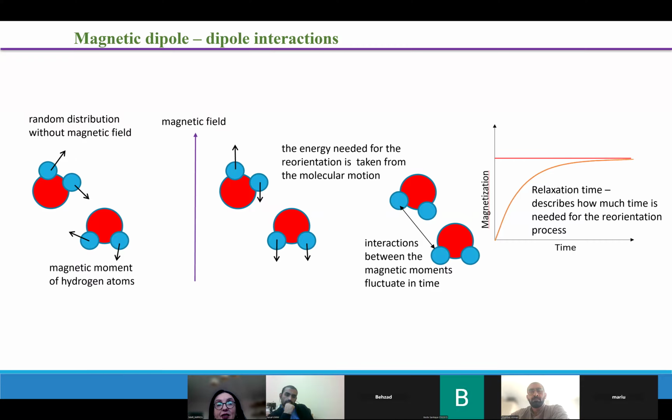You have to compare the distance which, I don't know, two drivers were able to make during the same time. Otherwise this does not make sense. It requires a kind of normalization, and here the time is the normalization that it refers to 1 hour. The same is if you try to describe how fast molecules move, you introduce two quantities. One of them is translation diffusion coefficient for translation diffusion. And what translation diffusion is, we already discussed.